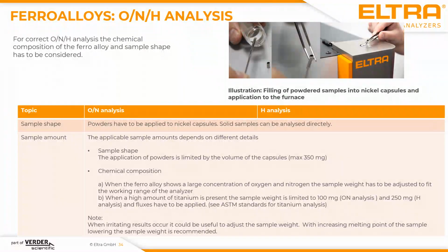The other thing which is important is the applicable sample amount. On the one hand, when you, for example, have a powder, every capsule has a limited volume. This does mean in practice that, for example, your applicable sample amount is limited to approximately 350 milligram.